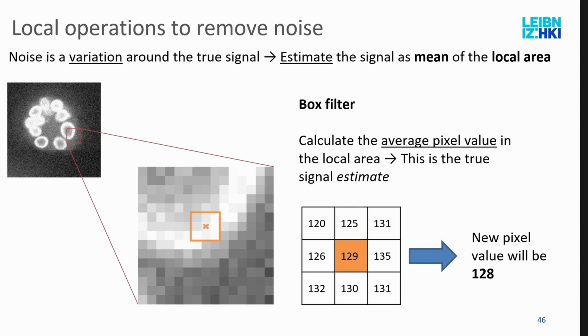But for biological images, imagine you have a cell that goes outside the border and is cut off. You would usually remove it from your calculations anyway. For example, you want to know the average cell size. Here, these are all in frame, so I can calculate the average size.